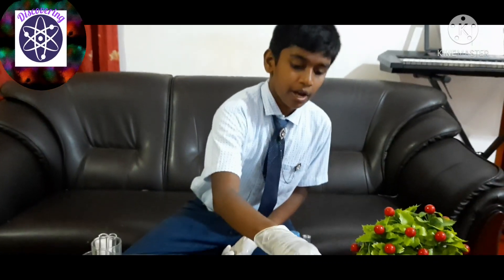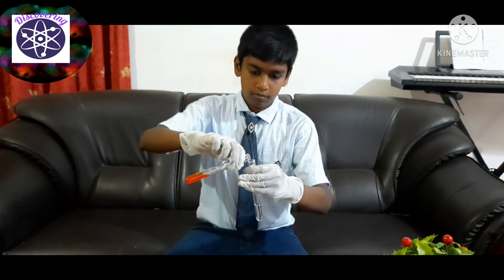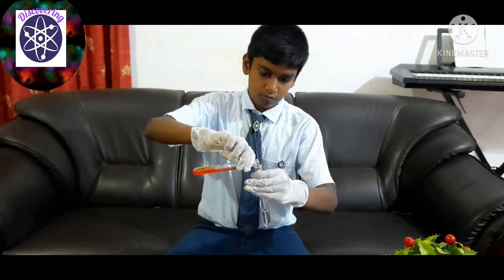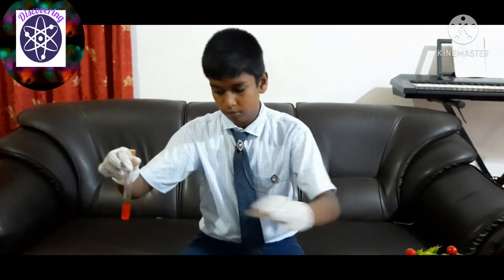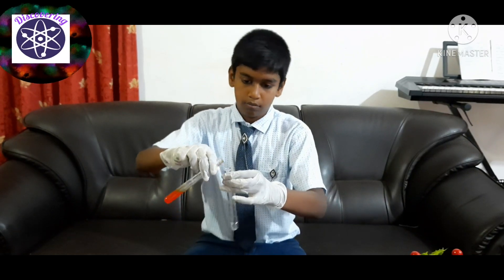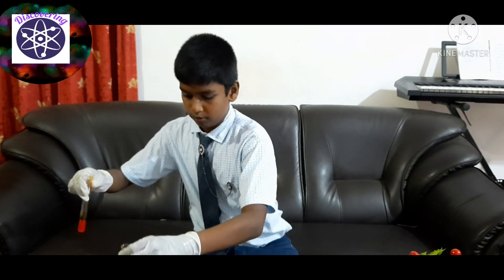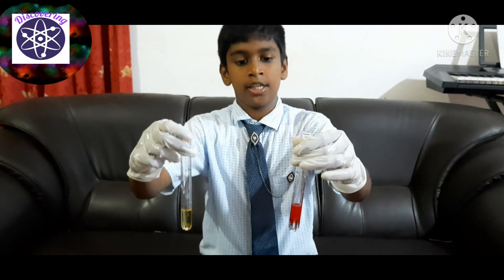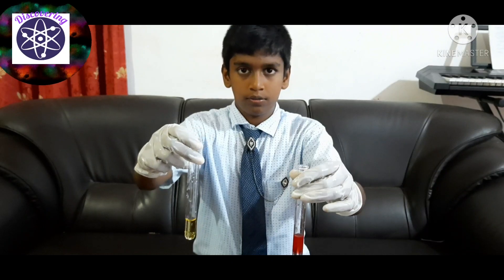Now let's go with methyl orange. I'm going to add the methyl orange into the acid and base. With acid it turned into red, and with base it turned into yellow.